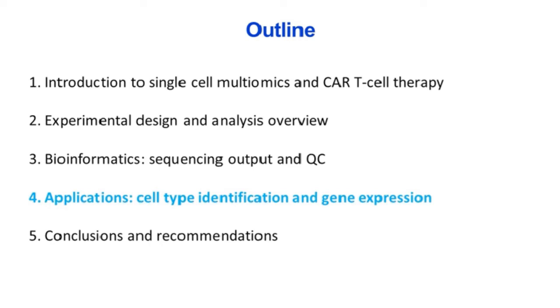And we'll show you a few applications. Based on the first question that you can actually ask with this technology: how many cell types can we identify, and what is the gene signature associated to each of those types?